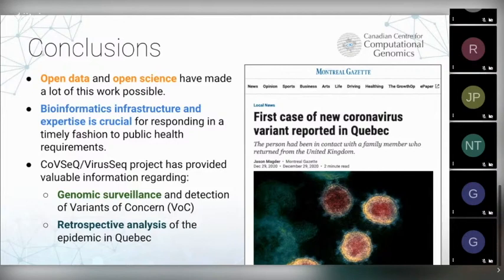And the reason for that is that with short reads especially, it's very hard to do that, because the short read will obviously not have a lot of information about that. But the other thing is that because this is an amplicon-based strategy, you can only phase within an amplicon, because once you do the amplification, you lose any information linking amplicons together. They kind of become their own independent thing. So the only way you could link them would be to other variants within that same amplicon. You could do intra-amplicon phasing.